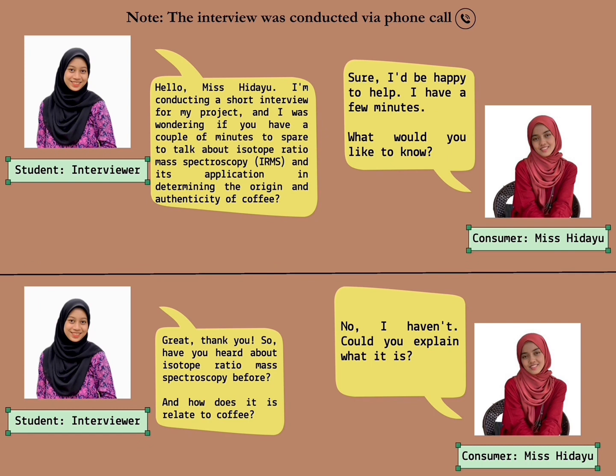Hello, Ms. Hidayu. I'm conducting a short interview for my project, and I was wondering if you have a couple of minutes to spare to talk about isotope ratio mass spectroscopy (IRMS) and its application in determining the origin and authenticity of coffee. Sure, I would be happy to help. What would you like to know? Great, thank you. So, have you heard about isotope ratio mass spectroscopy before, and how does it relate to coffee? No, I haven't. Could you explain what it is?